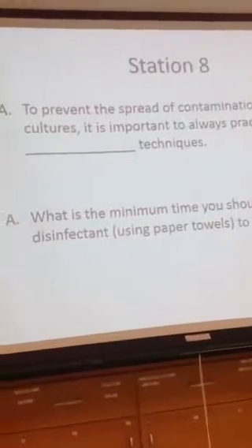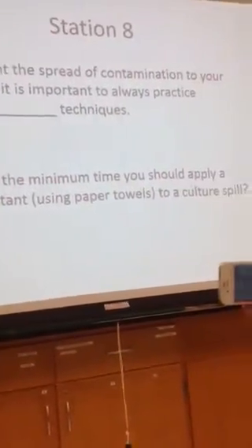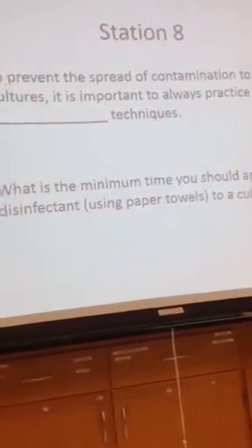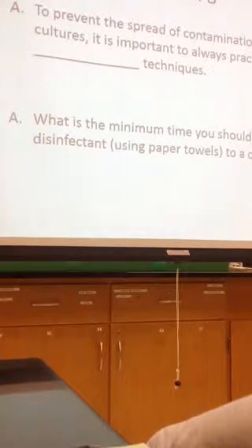This is in your lab manual. Okay? You need to know this. It should be in our safety sheet at the very beginning of this. The safety sheet that we went over, when you have a spill in microbiology, you have a certain amount of minutes you are supposed to apply disinfectant with paper towels over it. 1 minute? 20 minutes.